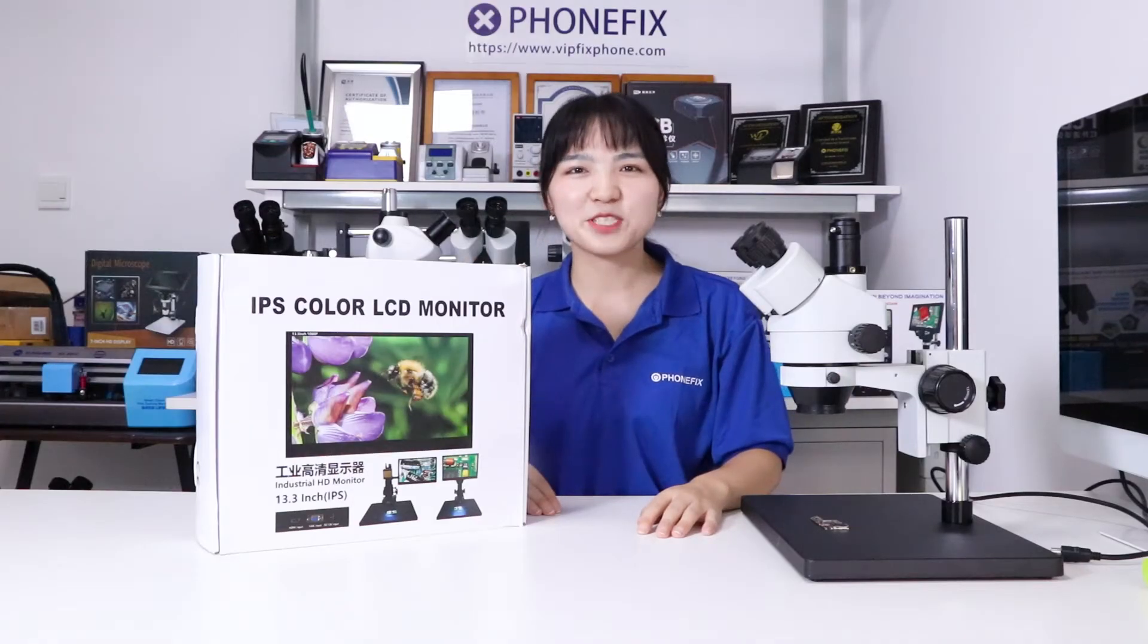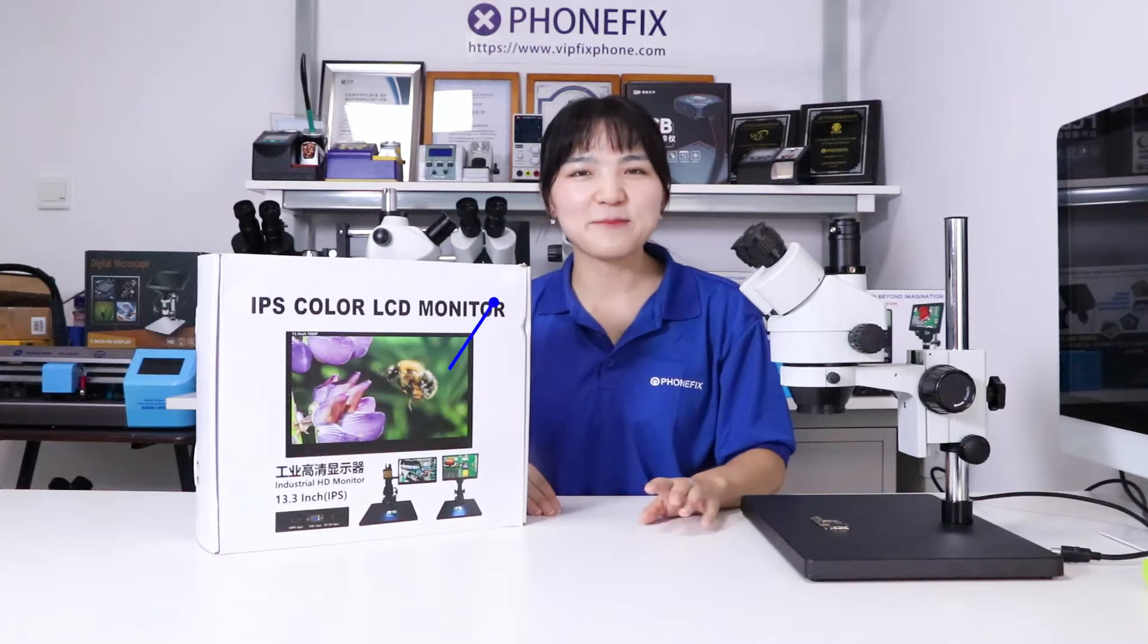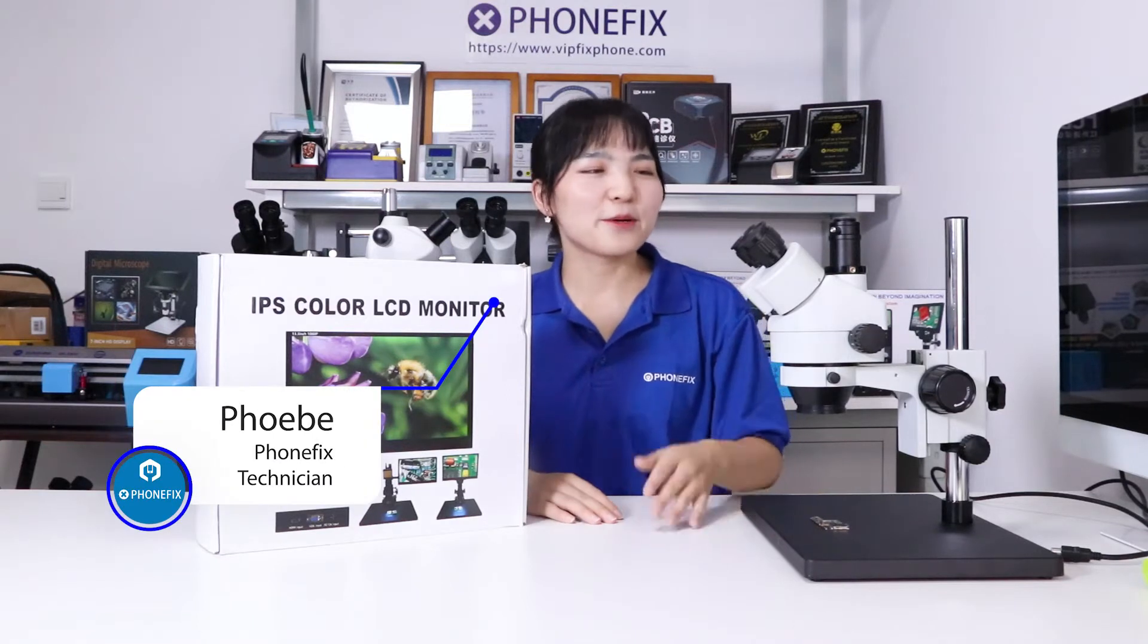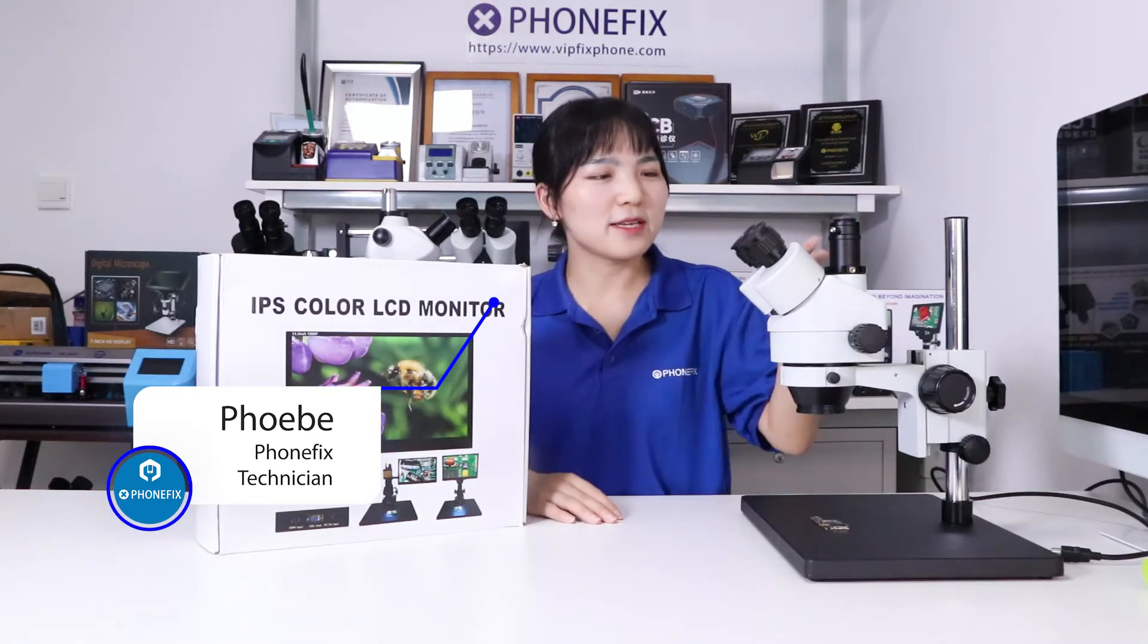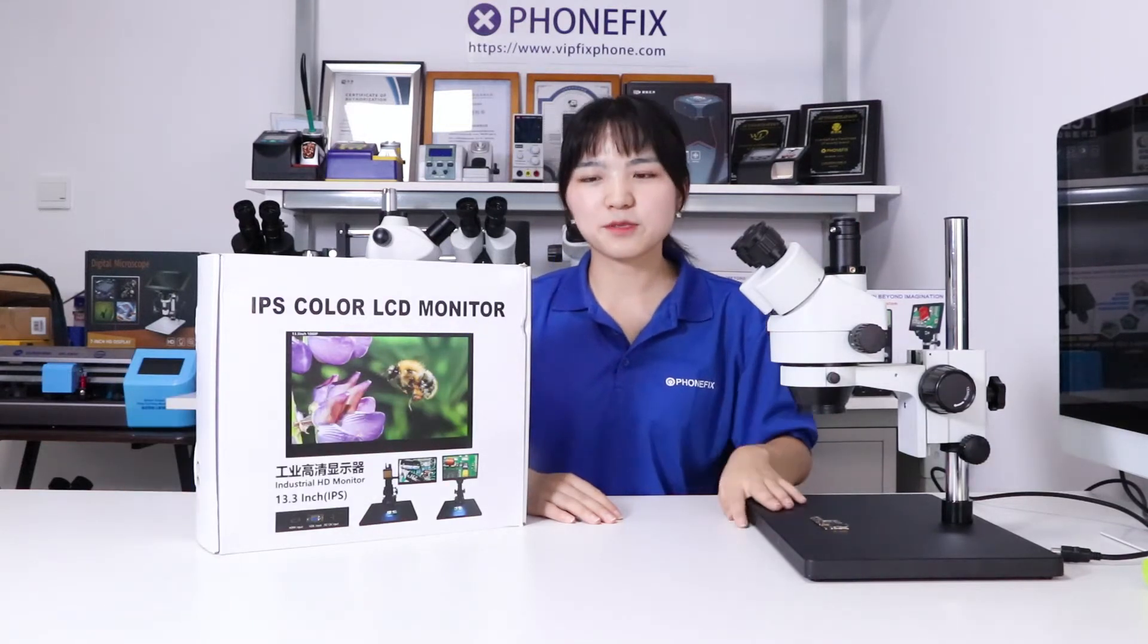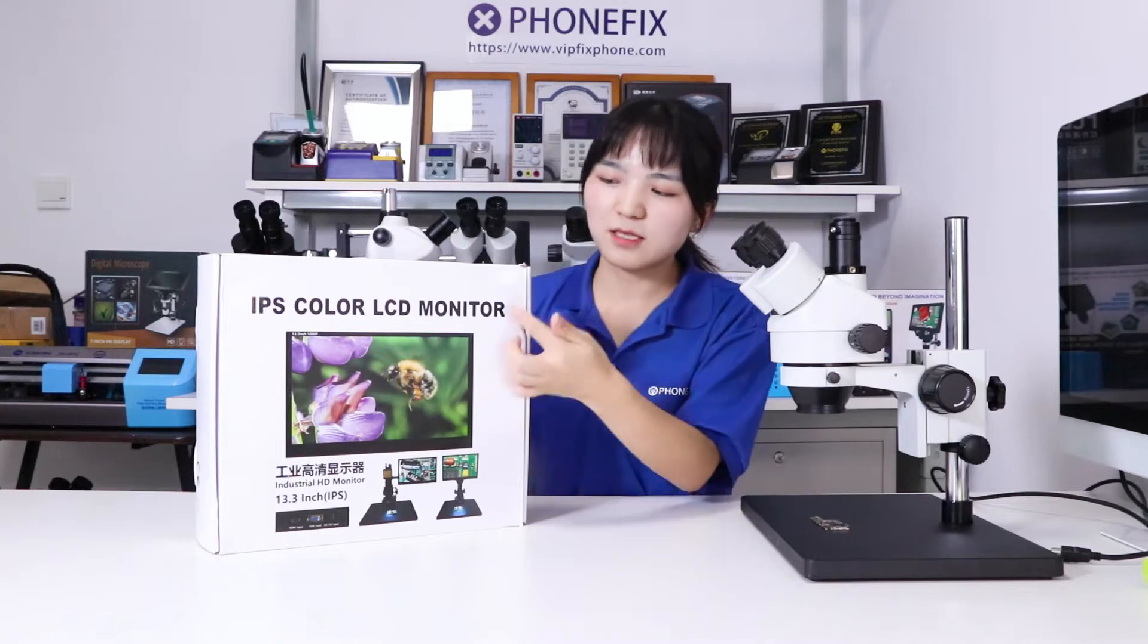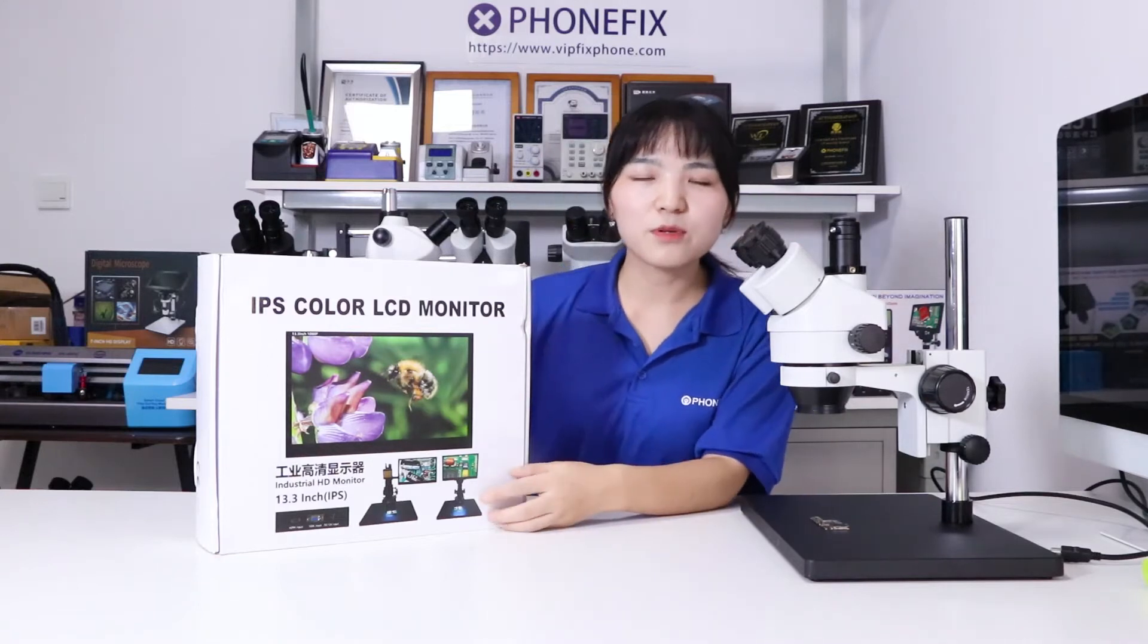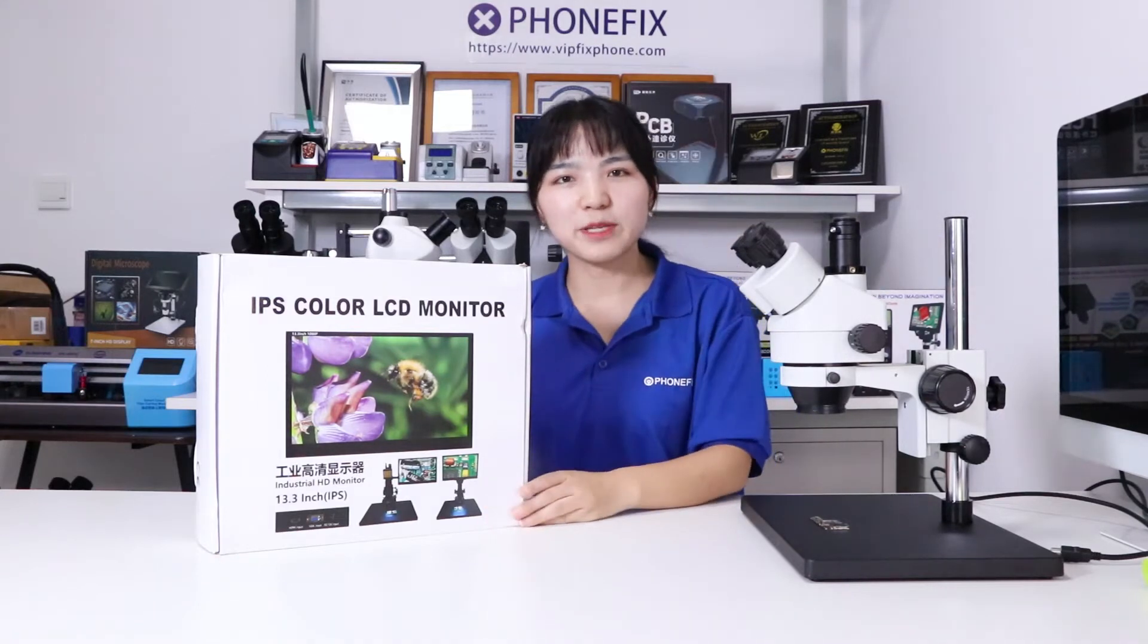Hi guys, welcome to the channel from PHONEFIX and FABY. Today we will show you the integrated trinocular microscope and the 13.3-inch monitor.